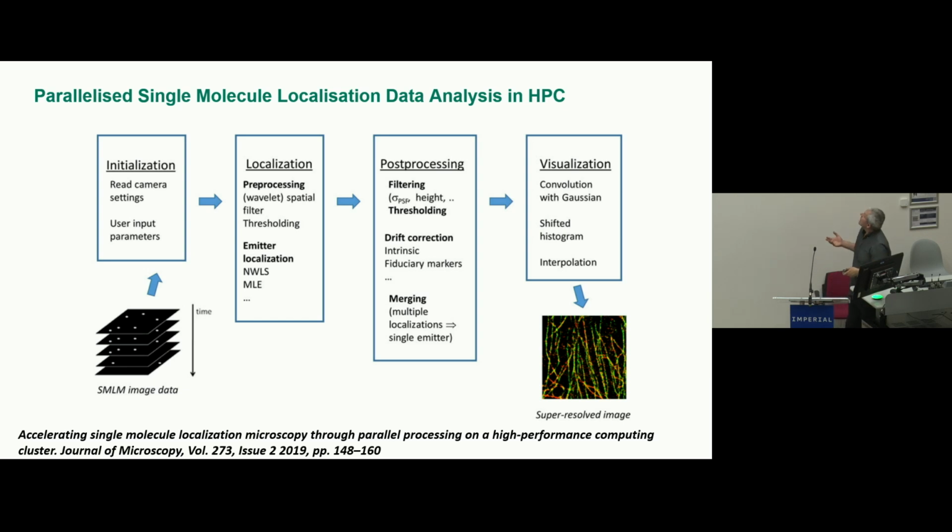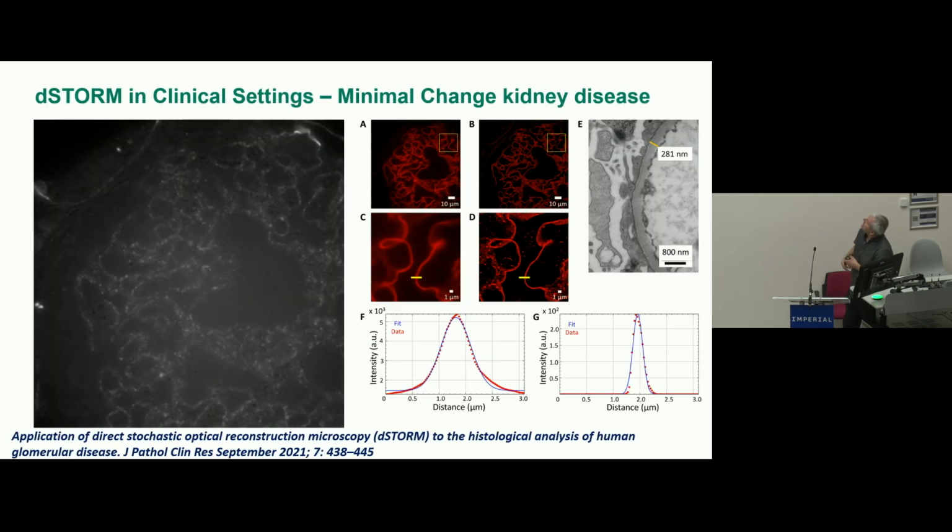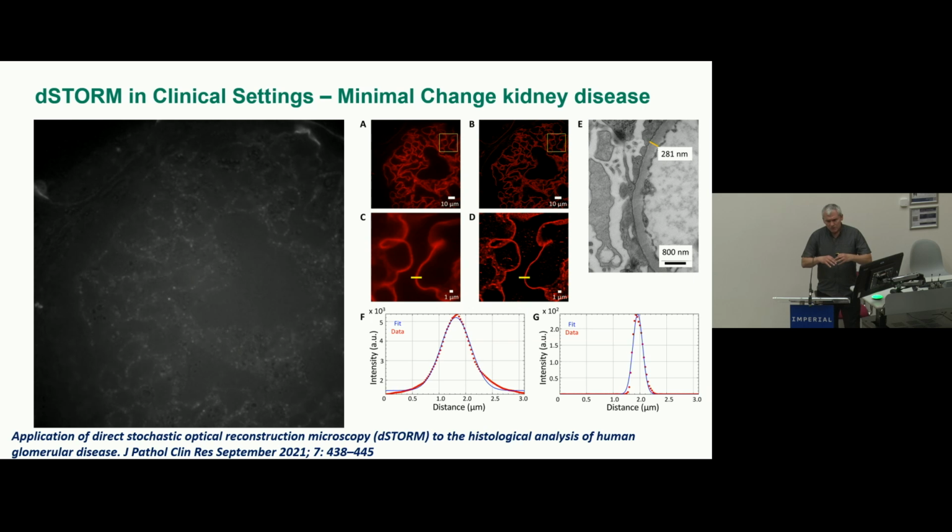Then after that, you can decide to increase the resolution per pixel in nanometers, or go to more cluster analysis. And let me dive into that. Now we can make these images, but we want to apply this to real problems in medicine.